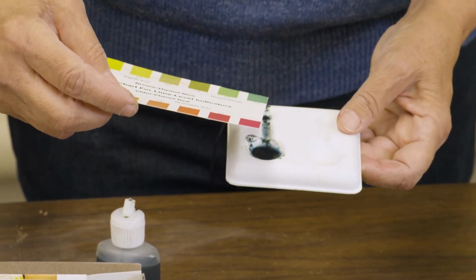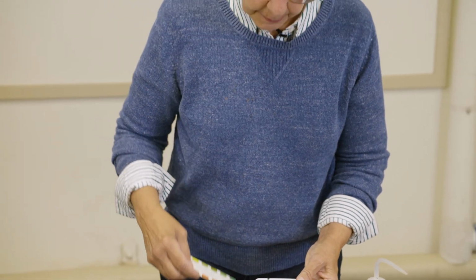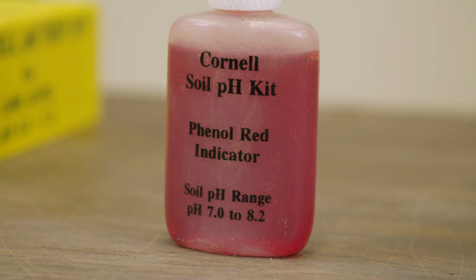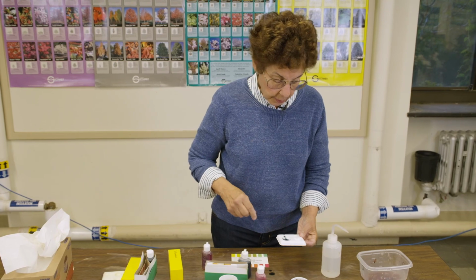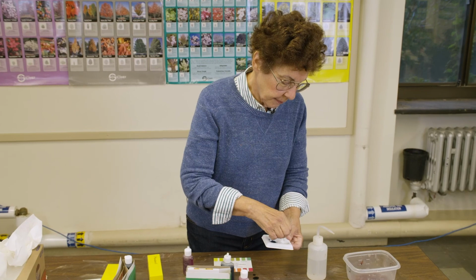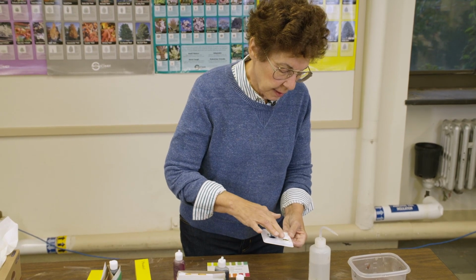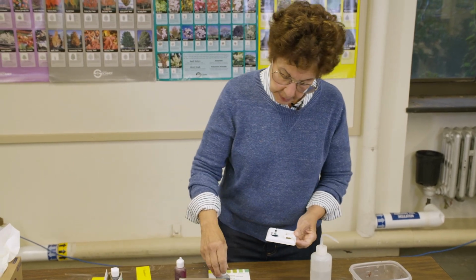But again, we're at the end, we need to go further to see if that's the final range of pH. So here we take the wide range test kit, which goes higher with phenol red or much lower with bromcresol green. We're going to go higher with phenol red because we stopped at 7.2. We want to go up in terms of seeing what the real pH is. So here we're going to put some more soil in the second bowl. By the way, you want to have your hands clean when you do this, so you're not introducing anything into the sample.